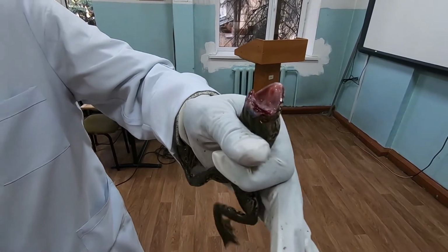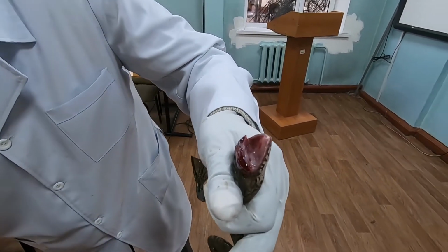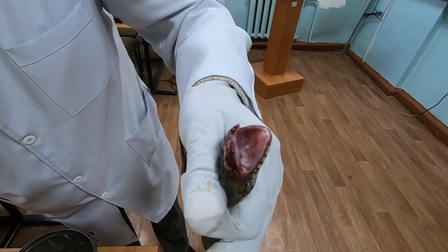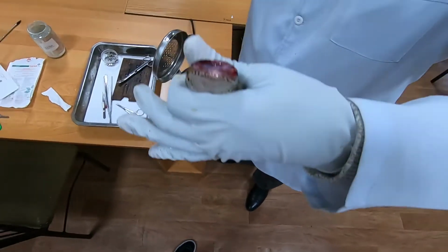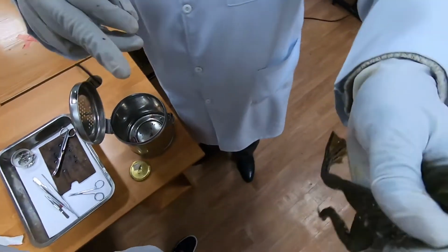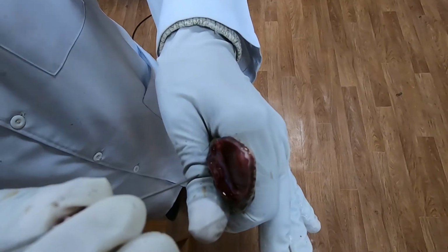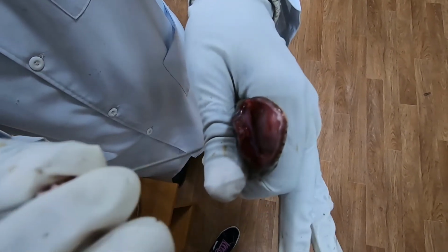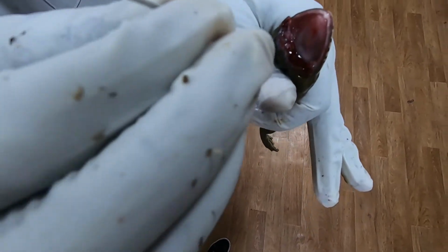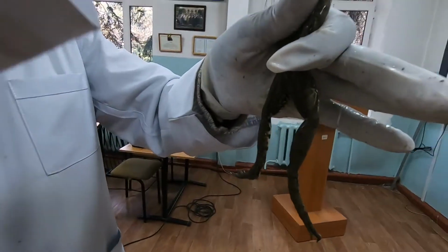Now we have exposed the central nervous system. So we take our pin, so that you can see. So you can see the whitish part here. This is the central nervous system. Okay?